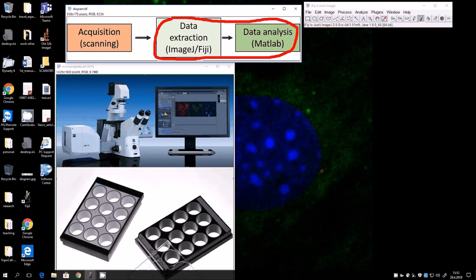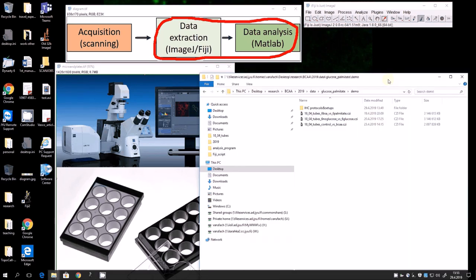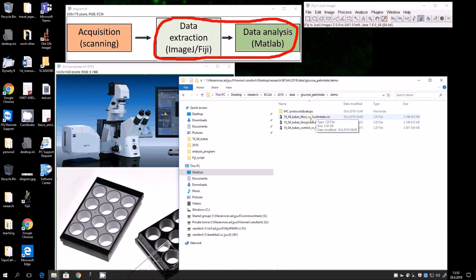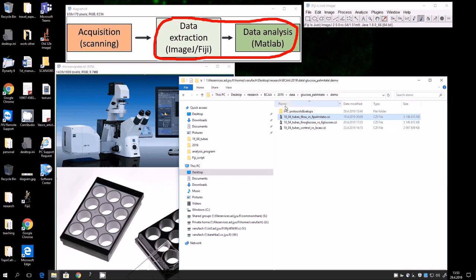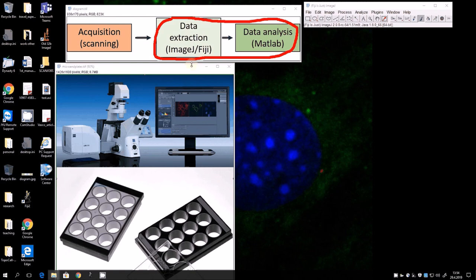Each plate in our setup produces a CZI file from the LSM 700. In this case we have three plates that have been scanned with different experiments, and each well also has slight variations. So we start in ImageJ by extracting the data from this point.